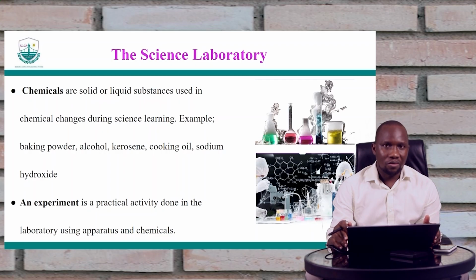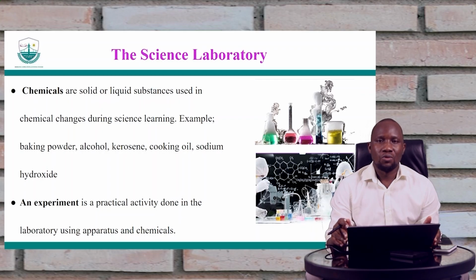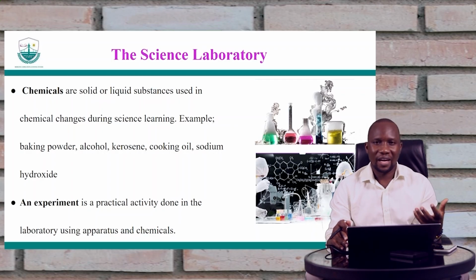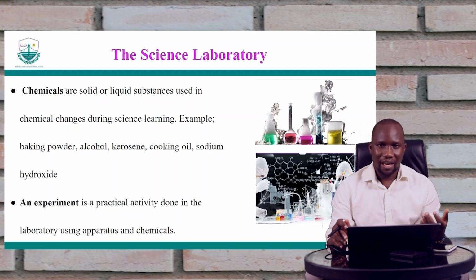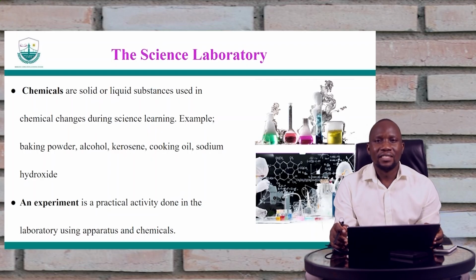So what is an experiment? I've been talking about it here. For example, you may decide to demonstrate the process of diffusion. You get a beaker, you put water there, and then you drop potassium permanganate, and then the color of the water changes.